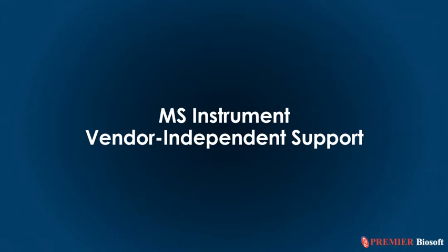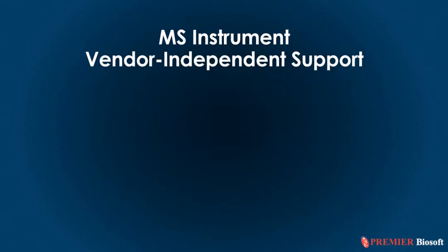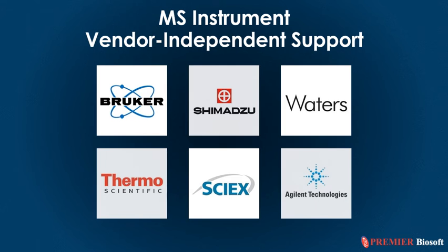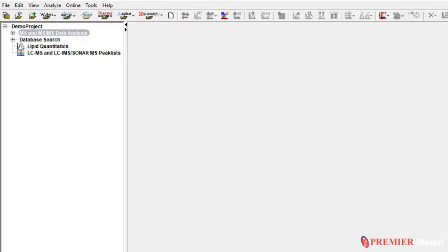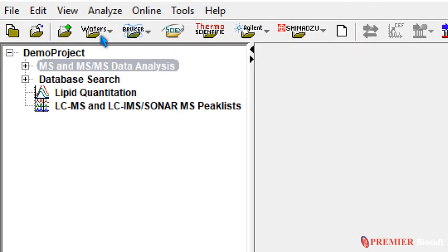Do you work with multiple MS instruments at your workspace? We've got you covered. SimLipid supports data from all major MS vendors. You can directly load one or more raw data files into SimLipid.